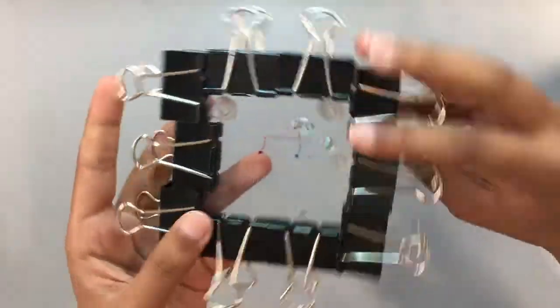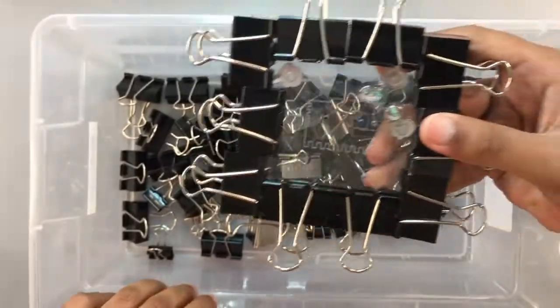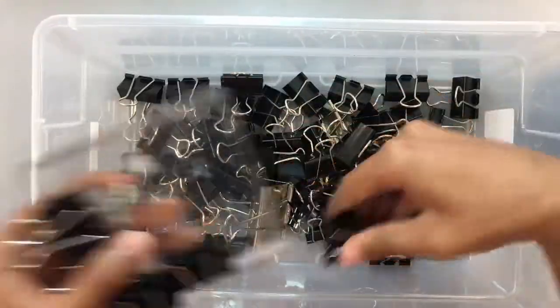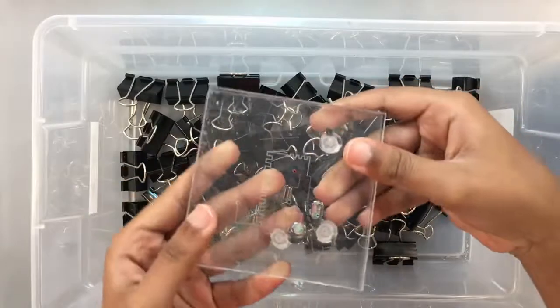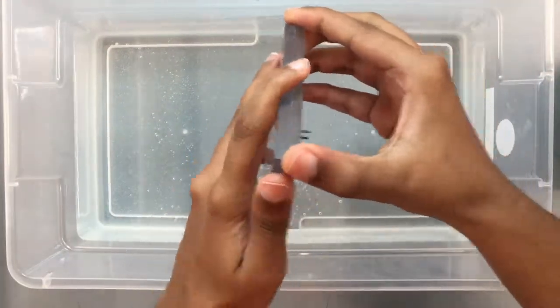First, remove all the binder clips around the chip. Carefully separate the layers without damaging the PDMS.